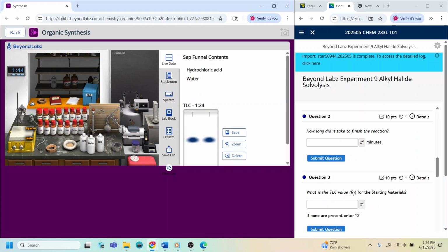and the organic. So now when we added the NaOH, it is present in the aqueous layer and it took with it the HCl. So if I bring my cursor to the aqueous layer, you see that you have hydrochloric acid in it and water. This is neutralization, okay? And then the top layer is the one that I need, that has the 2-methyl-2-propanol and the diethyl ether. The diethyl ether will evaporate. So this is it. I got my product.